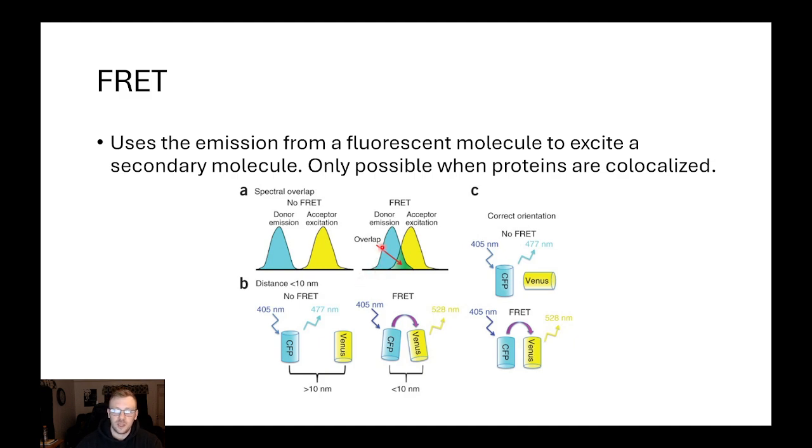So you hit protein 1 with 405 light. It undergoes a Stokes shift to, I'm sorry, I've been saying this wrong, 528 is our protein B. Protein B is labeled as a 528 nanometer molecule. So our emission from 405 undergoes a Stokes shift, and we don't quite get up to 528, which is fine because these things have what's called off-peak excitation.